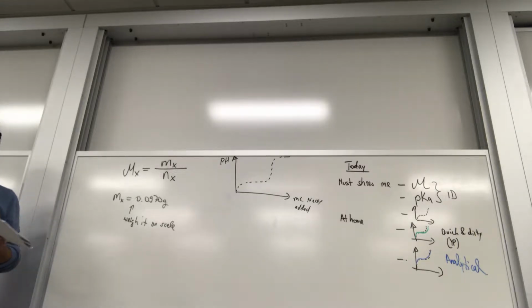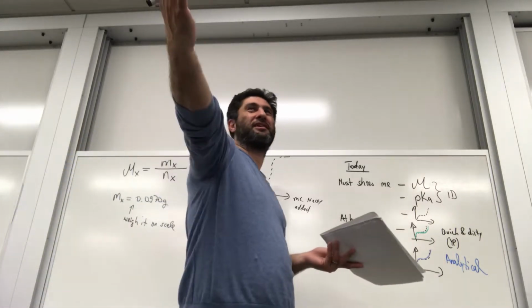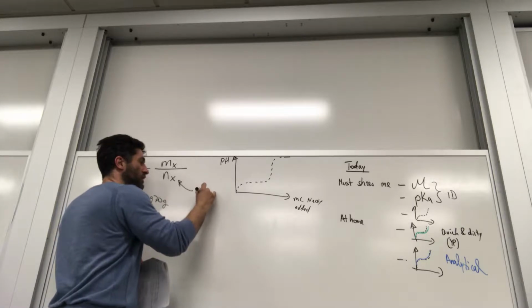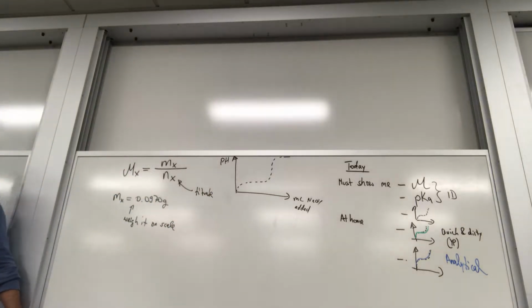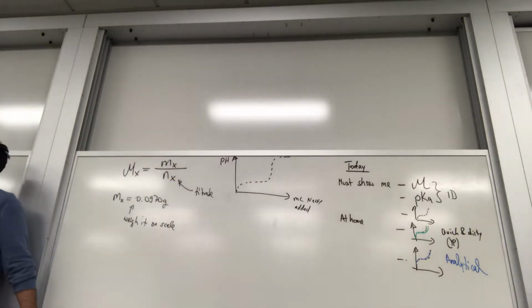So the moles of the unknown acid, we did exactly what you said, we titrated. So in order to get this, we titrate. Now, if I look at the curve, on this curve, how far did I titrate to? About 50 milliliters or something, right?